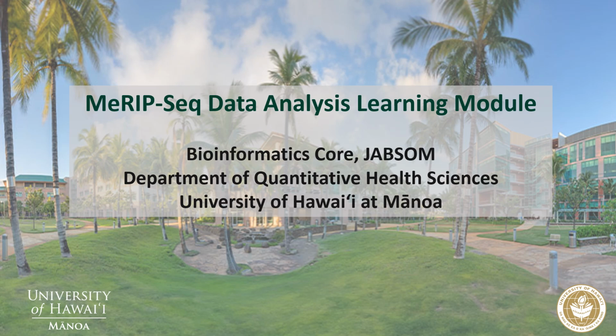Welcome to this introduction to the MeRIP-seq learning module. This module was developed by the Bioinformatics Core at the University of Hawaii at Manoa within the Department of Quantitative Health Sciences. It is a cloud-based, hands-on resource designed to guide users through the analysis of RNA methylation, specifically M6A, using MeRIP-seq data. This workflow emphasizes reproducibility and accessibility, supporting both beginners and intermediate users in bioinformatics.